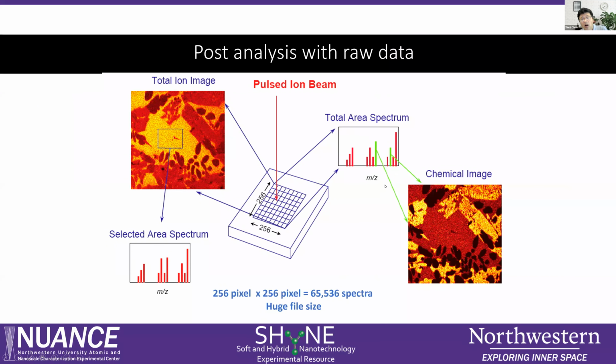Okay, so for all SIMS, when you collect the data, you need to choose what pixel size you want to use. Commonly for the spectra, we use 128 by 128. For mapping, we use 500 or even 1000 by 1000, commonly 500 by 500.